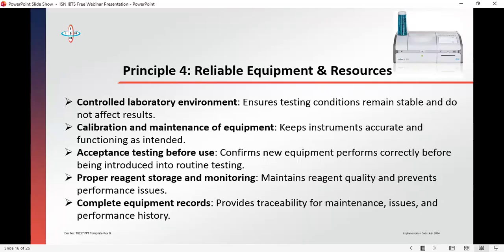We need to have certificates for those because a certificate is issued at every point when an instrument is calibrated. For instance, for those of us that have automated chemistry or hematology analyzers, when they are calibrated, your instrument prints out a result, which stands as a certificate that, yes, this has been calibrated.